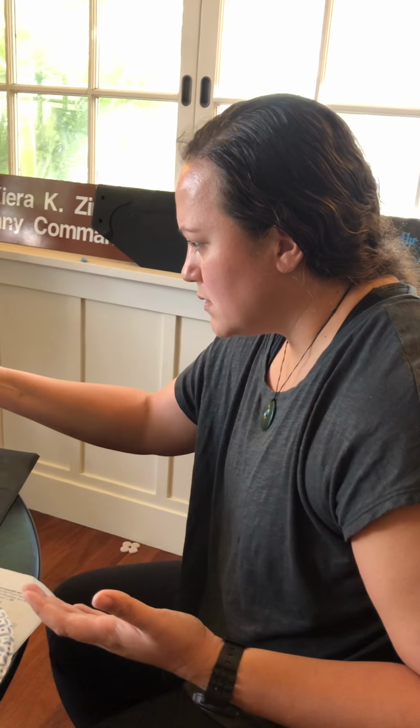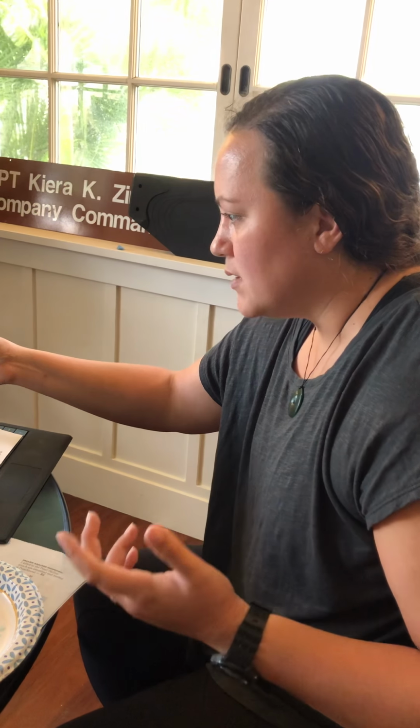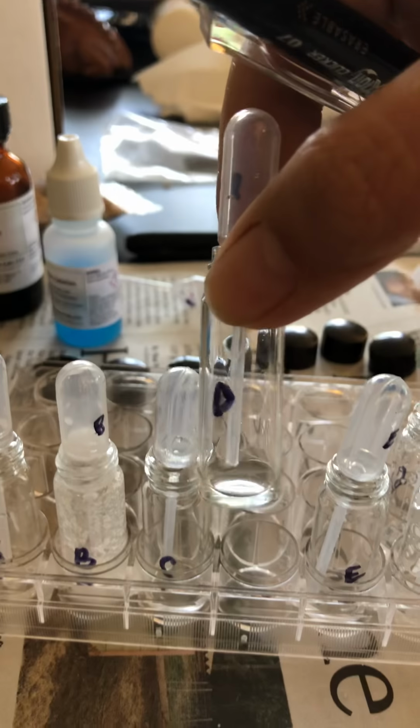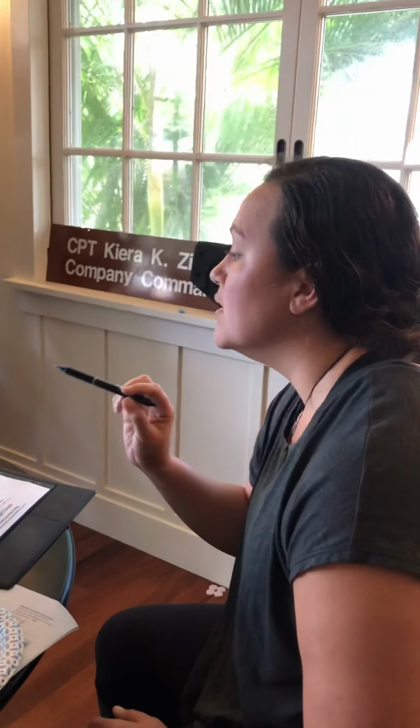Going back to my notes, the only other unknown left at that point that had solvated was D. It's pretty clear. So I went with sodium acetate as D, since it's the only one that was left that was soluble in water. So that leaves caffeine and thymol, which were A and B.